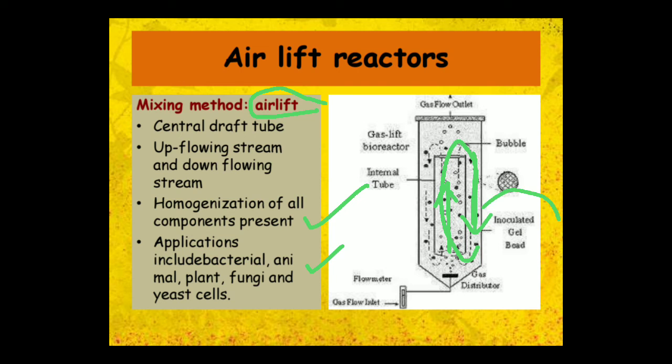Fine, inoculated gel beads are there. This is the internal tube, this is the central draft tube, this tube is the main equipment in the whole airlift reactor.